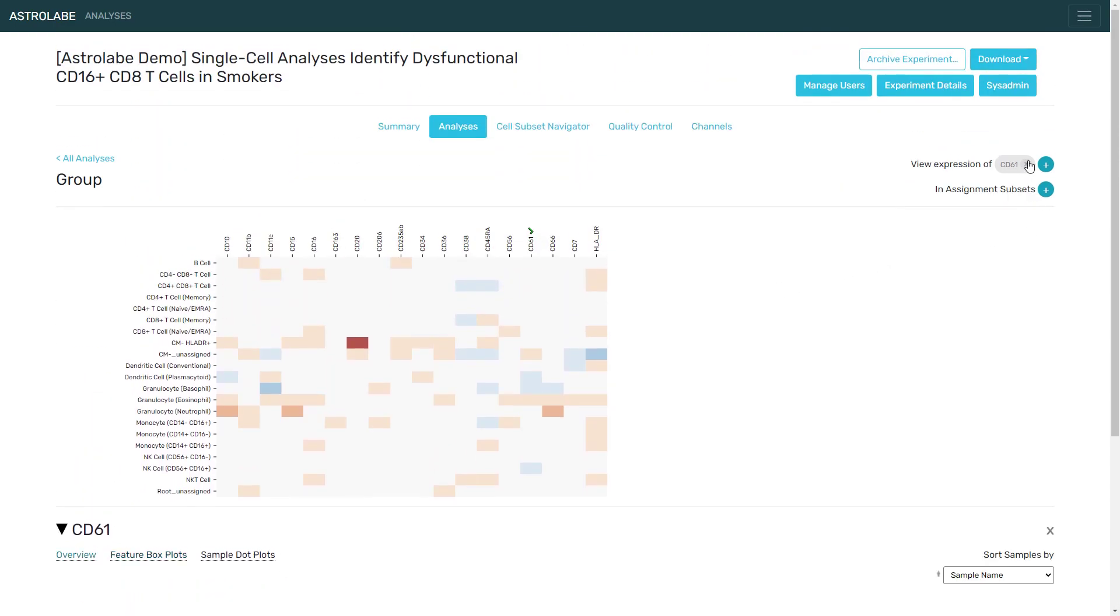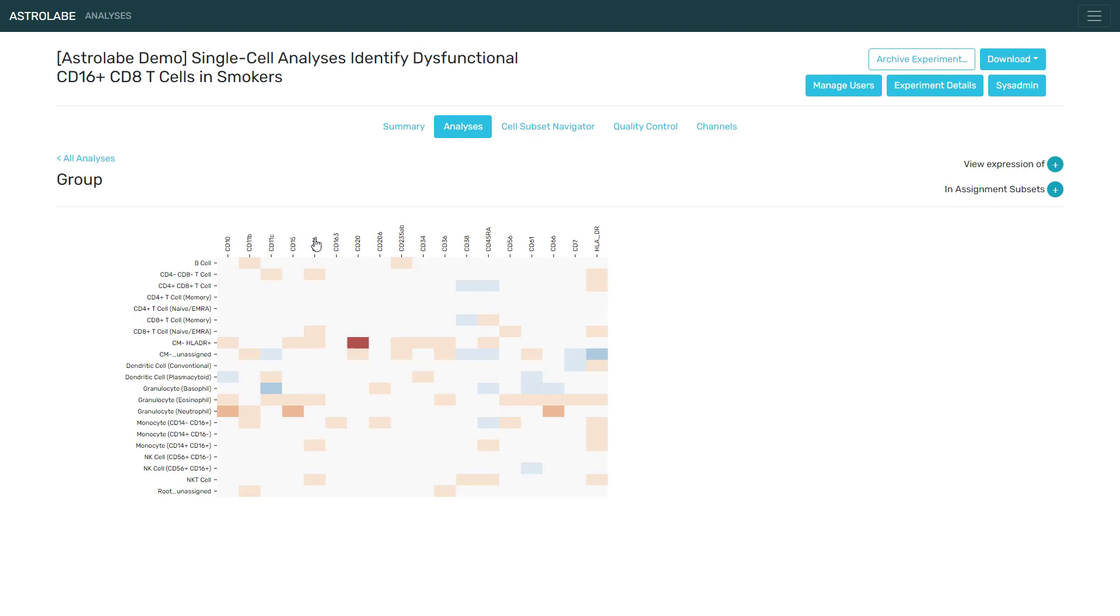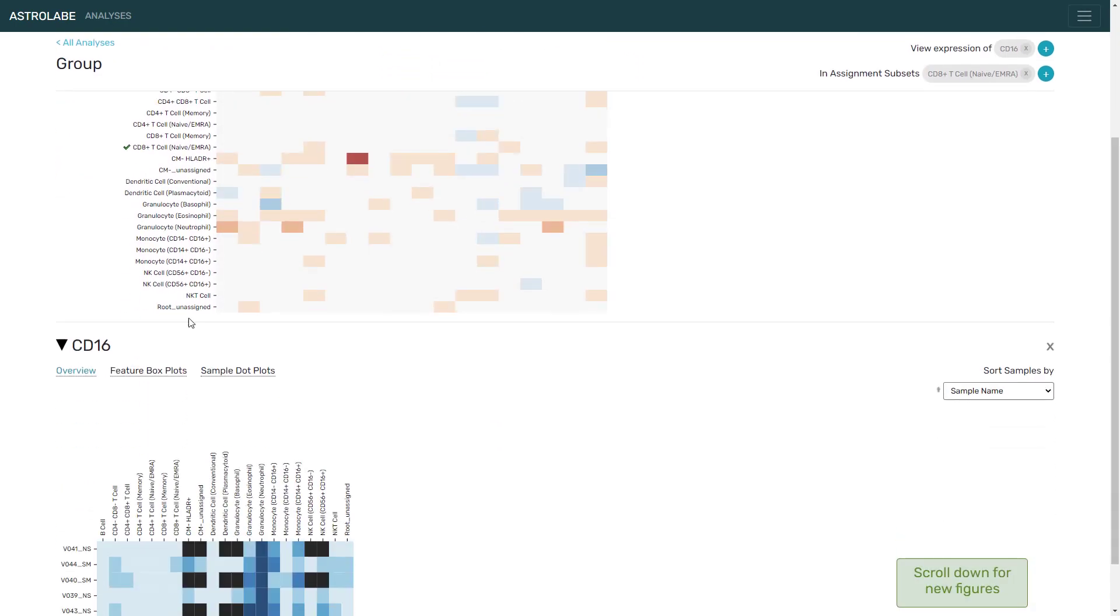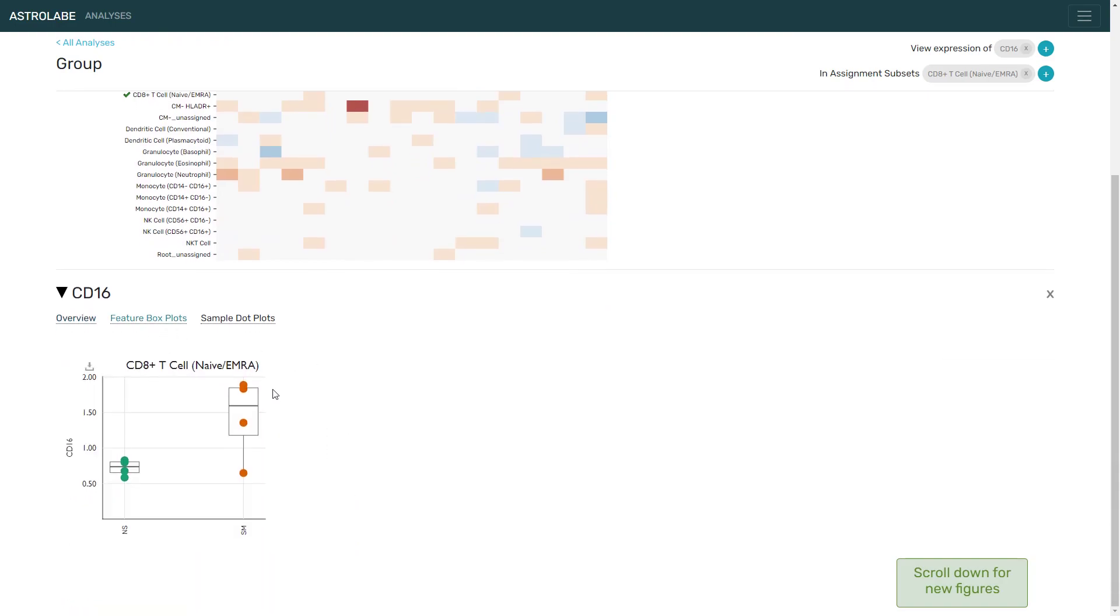Another trend we can examine is if we look at CD16 and go down the column. We can see that there are differences in numerous populations, notably within the naive or EMRA CD8 T cells, the CD45 positive RA positive. So if we click on them and click on CD16 and go to the feature box plot, there is a very clear increase in the level of this marker between the smoker population and the non-smokers.